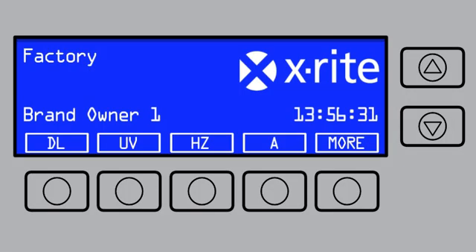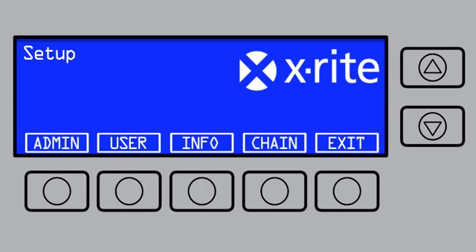From the main menu, press and hold the More button until you see Setup. Press Admin to access the Advanced Setup 1 screen. If prompted, enter your password.